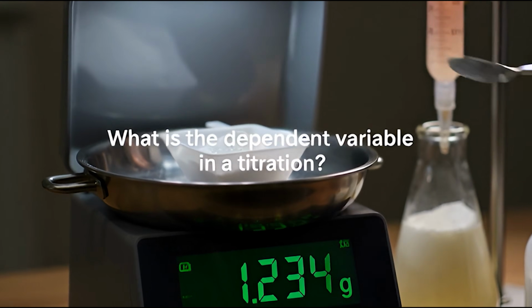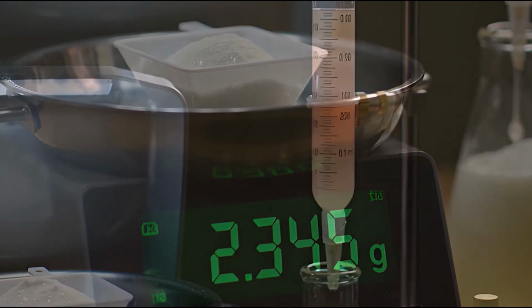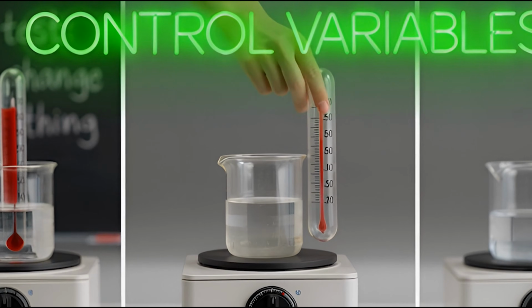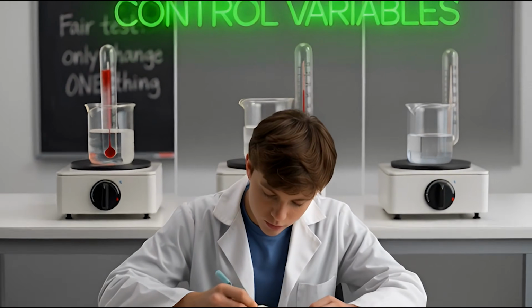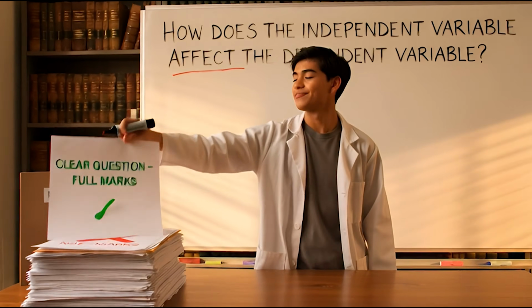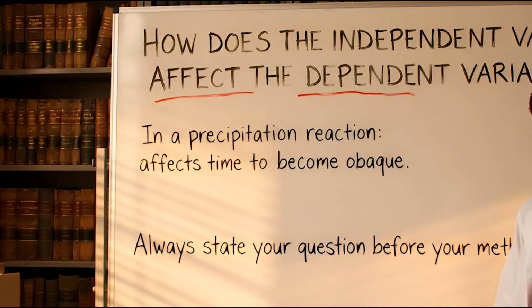The dependent variable is what you measure. In a titration, it's the volume from the burette. Control variables, keep them constant. Change only the independent variable. That's a fair test. Always write your investigation question first. Clear question, clear method, better marks.